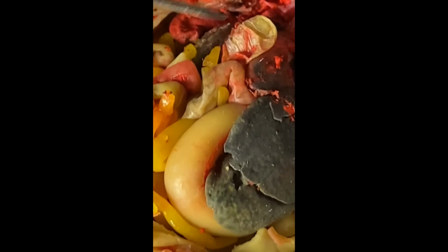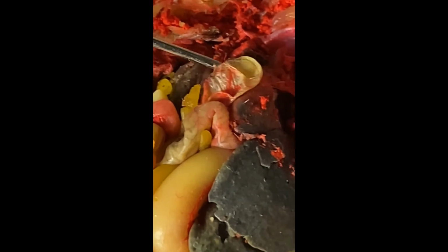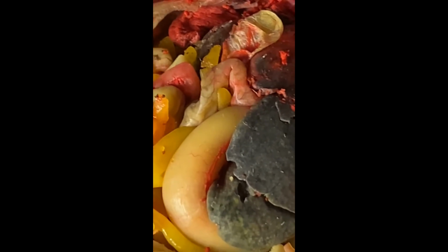And if you look closer at the liver, you're going to see this clear pouch-like structure over here. And this would be the gallbladder of the frog. The gallbladder's job is to store the bile that the liver secretes.